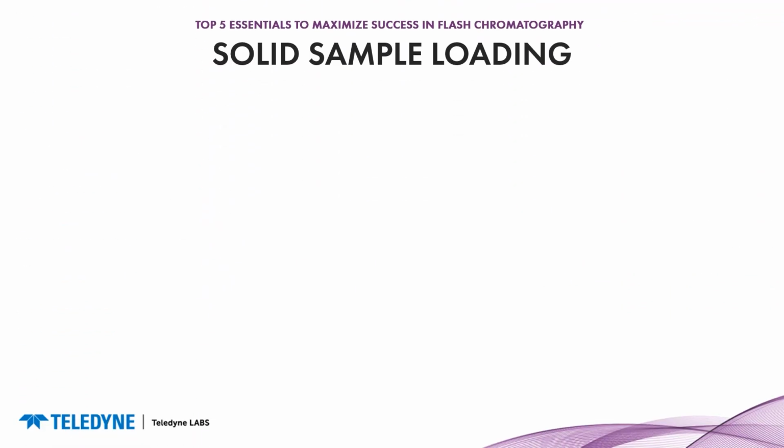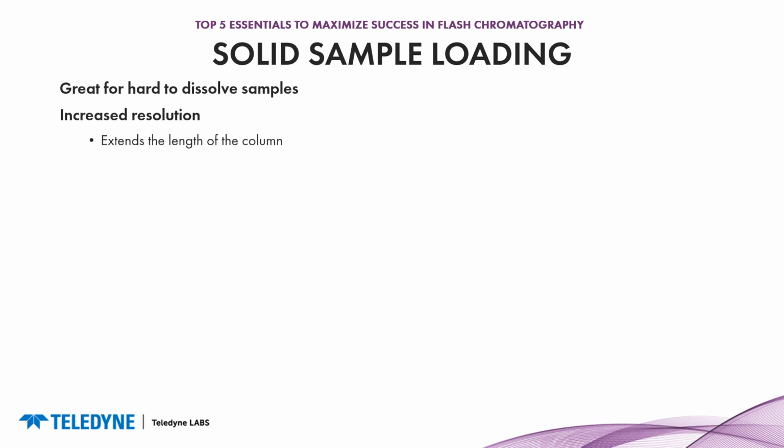Now, the other form of sample loading you have is solid loading, and solid loading is really good for hard to dissolve samples. It can also increase resolution by extending the length of your column. So in order to demonstrate that, I thought it'd be a good idea to bring Ready and the Bear back.